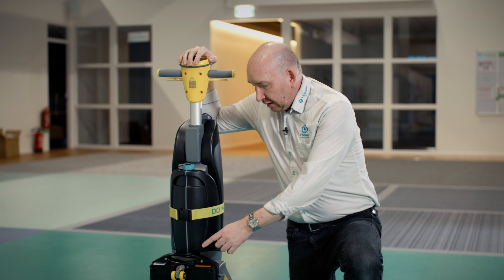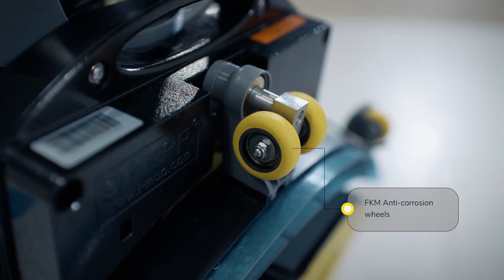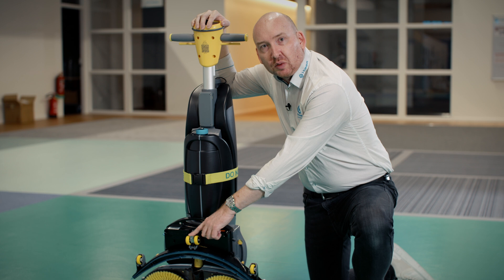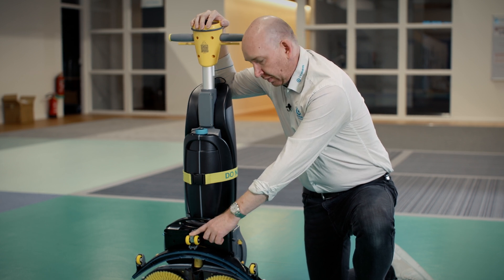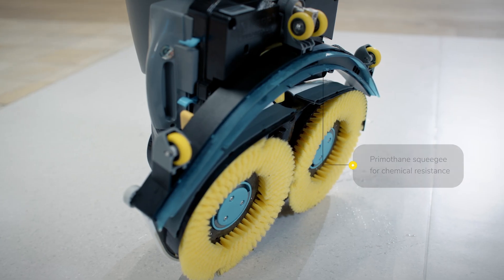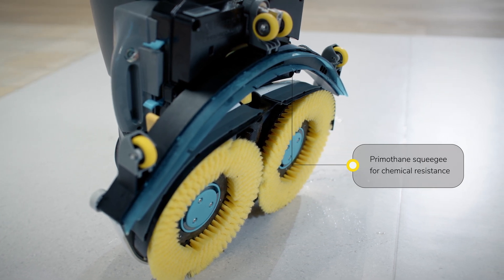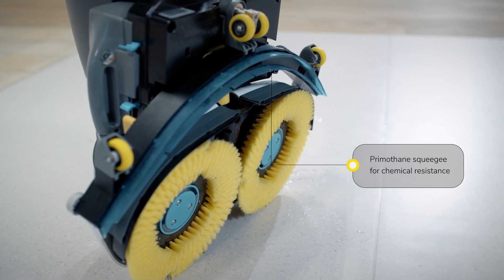Continuing down, we see that we have special wheels. These yellow wheels — both the transport wheels in the front and the wheels on the squeegee — are made of FKM rubber, which is resistant to most types of detergents or disinfectants that you would use in a clean room. We also have polyurethane squeegee blades for the same reason. These polyurethane blades have no off-gassing and are compatible with most disinfectants and cleaning detergents used in your clean room.